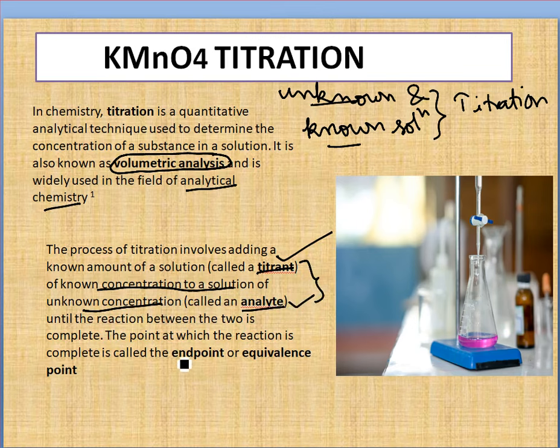Next point is end point. You can see here the color of the solution will be light pink. Okay, this will be the end point. Clear, guys?